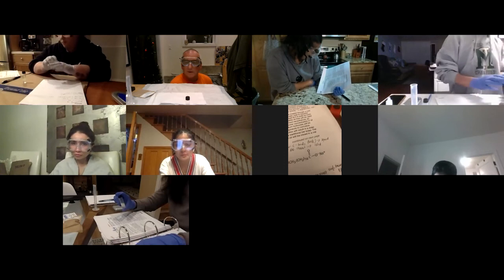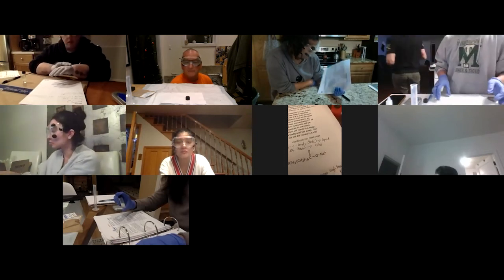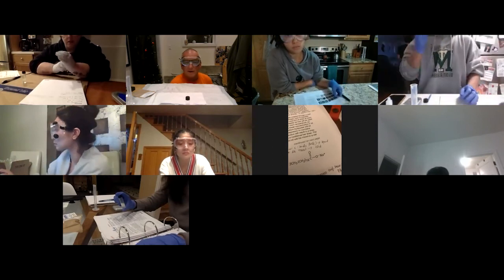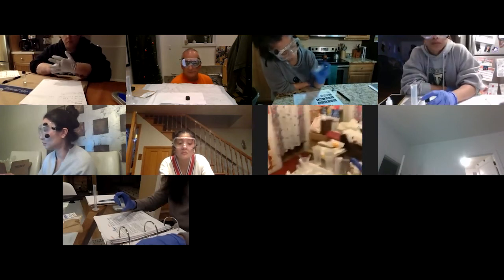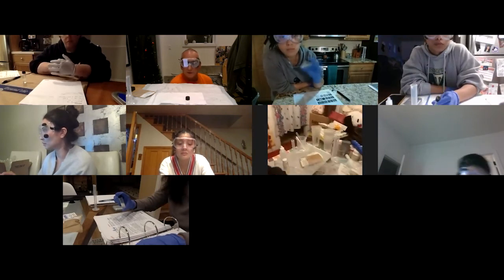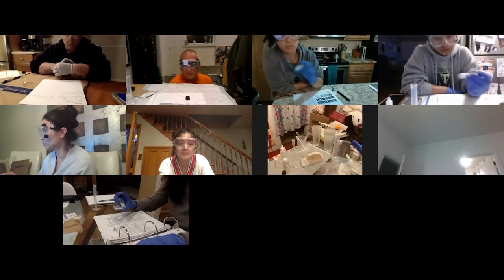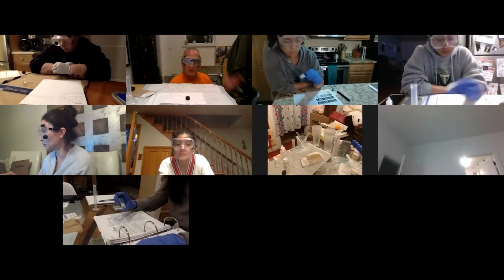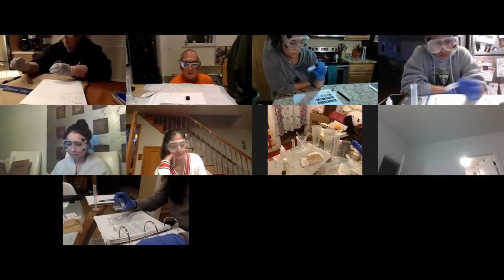What do you think? Yeah, water. It's much more soluble in water. It has 3 hydroxyl groups, all hydrogen bonding. So it will definitely go to the water layer. So when we filter it, we should be filtering all the glycerol away and just be left with the fatty acids.